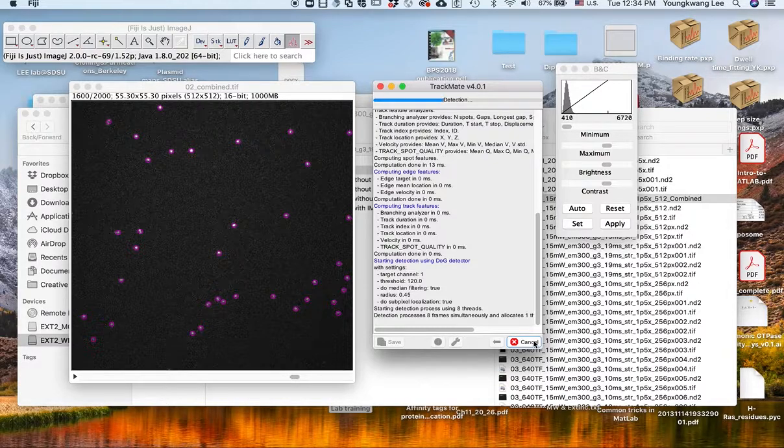Just to explain a little bit more, what we are doing here is, you can use either Igor or MATLAB to analyze the data. Here we will use only Igor to analyze the single molecule tracking data. Depending on whether you use Igor or MATLAB, the image property setting is different. When you use Igor, you put in all the real physical parameters: how many micrometers correspond to a pixel, and the time scale of the image.